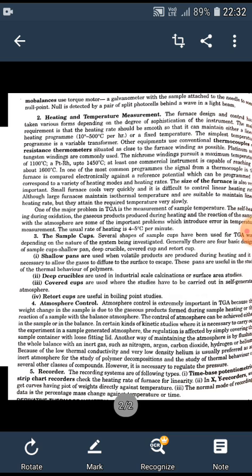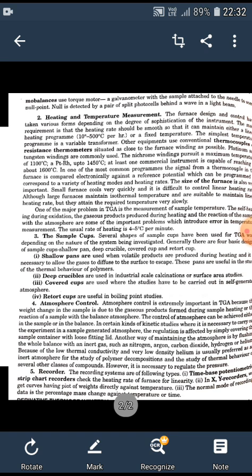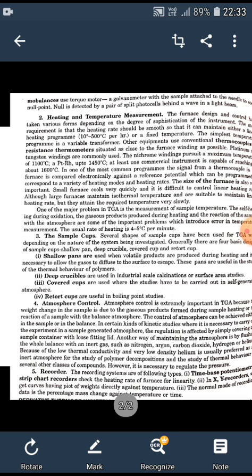The last component of the instrumentation is the recorder. The recording systems can be time-based potentiometric strip chart recorders, which check the heating rate of the furnace for linearity, or they can be XY recorders, from which we get curves having a plot of weights directly against temperature. And another method can be the normal mode of recording data, which is the percentage mass change against temperature or time.